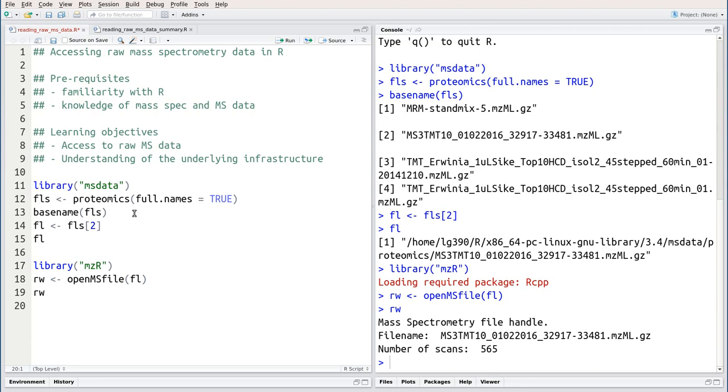This means that even if we loaded one huge file, opening this file handle would be very, very fast.